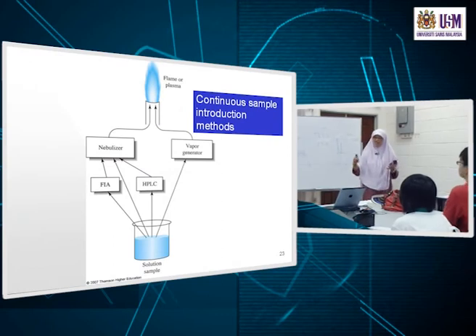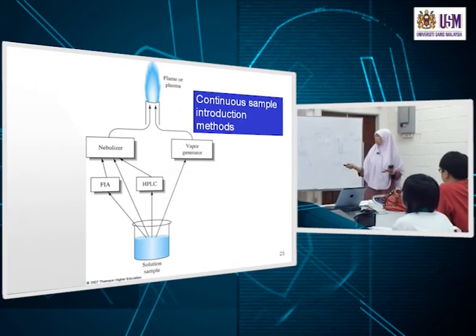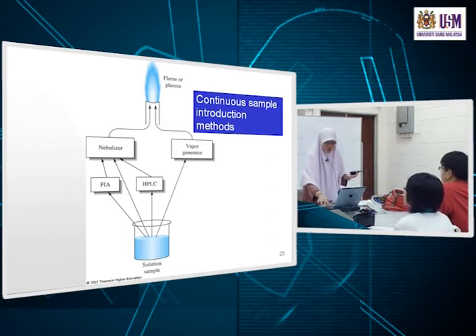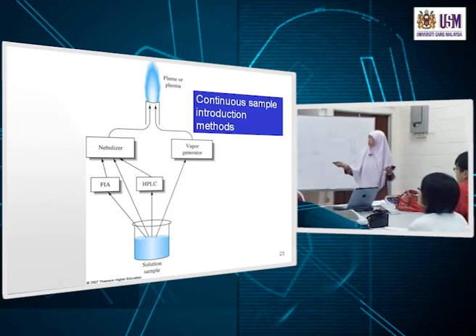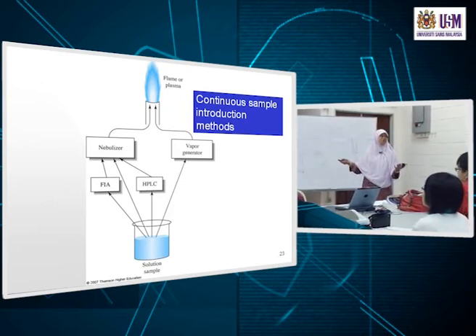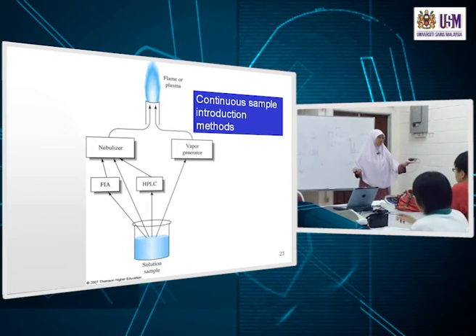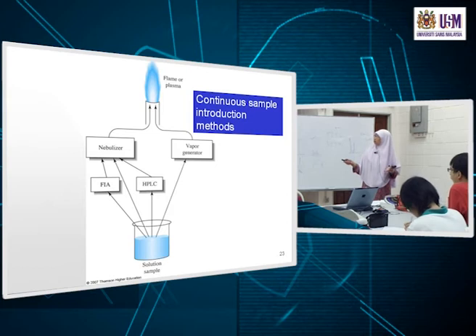So similarly here, you have a nebulizer too, where you have solution becoming vapor, okay? So your sample will be introduced into the nebulizer, which will then form a vapor, aerosol, small droplets of the solution. And then this will be introduced into the flame. The processes shown here: solution, nebulization becomes an aerosol, tiny droplets of solution, each droplet containing your Na+, Cl-, etc., whatever is in your sample, which will have to undergo desolvation.